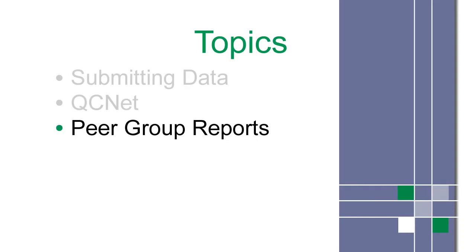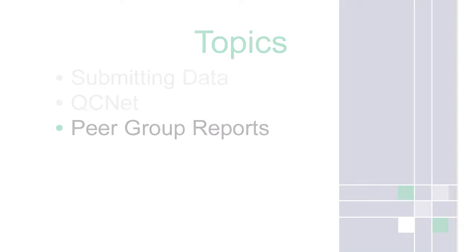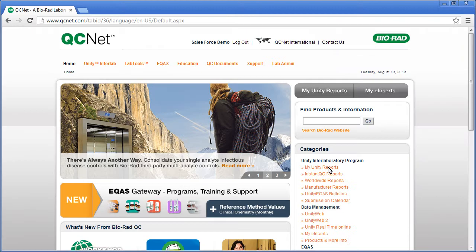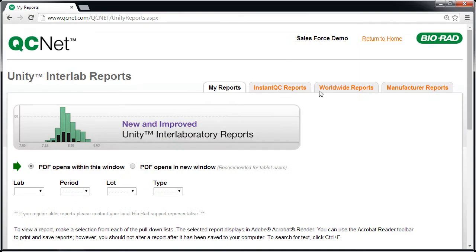Now that we're logged on, let's access peer group reports. Click My Unity Reports. This is the My Reports page.